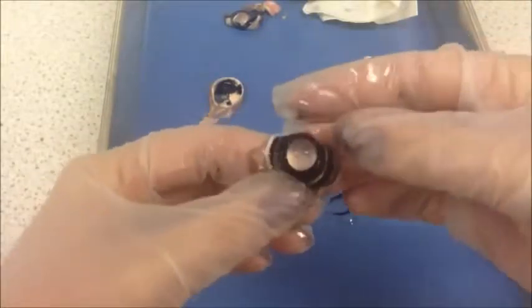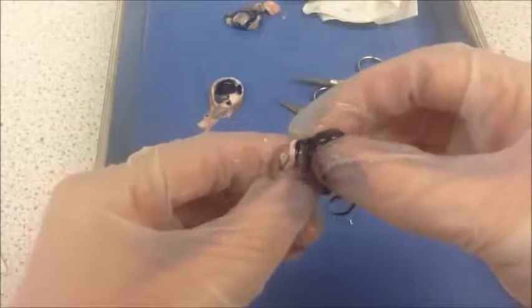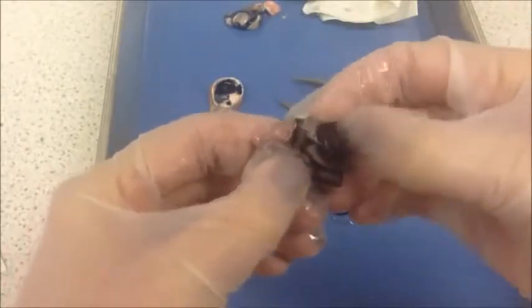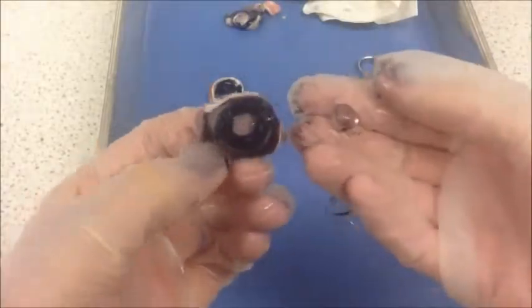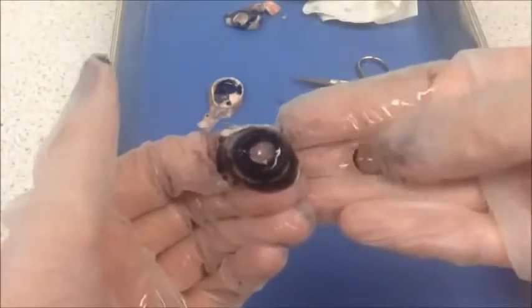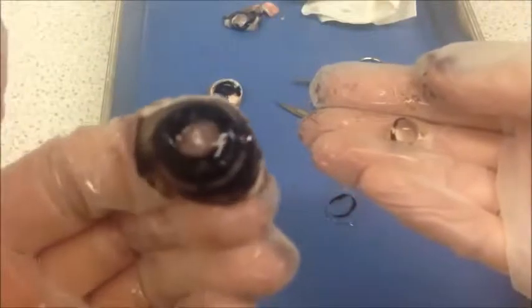The camera hasn't decided to focus here, but what I'm doing is pulling the remaining vitreous humour from the inside of the eye. Notice that I pull away some of the iris too. I am now gently pulling a structure called the lens from the front of the eye. The lens focuses the light entering your eye.